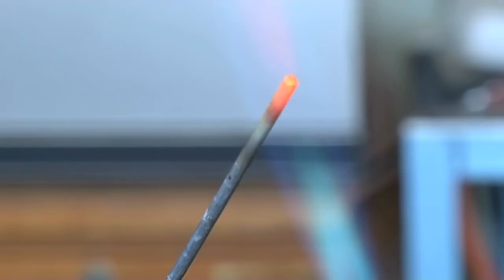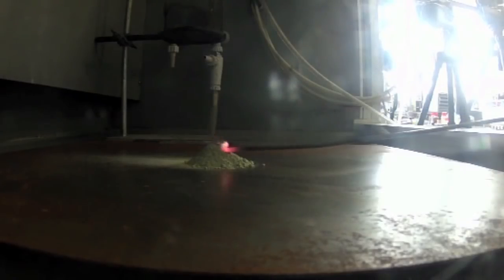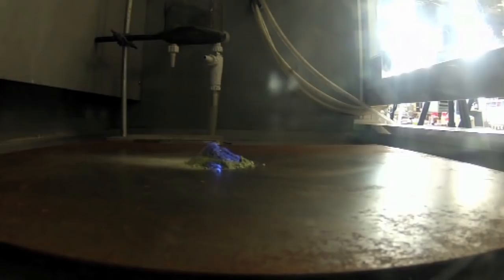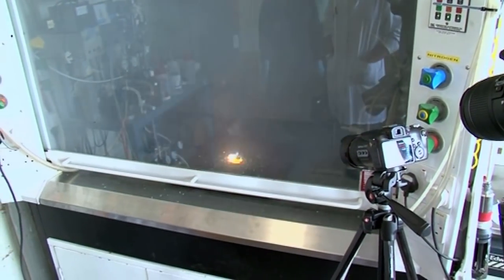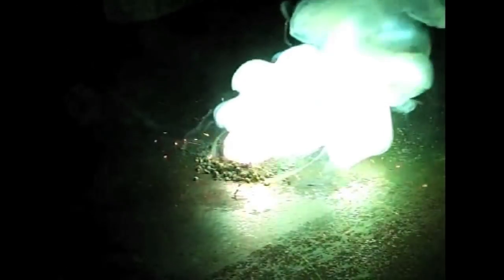Neil's going to be in charge of the blowtorch and I'm going to hold on to the rod. Let's go. That worked a treat.